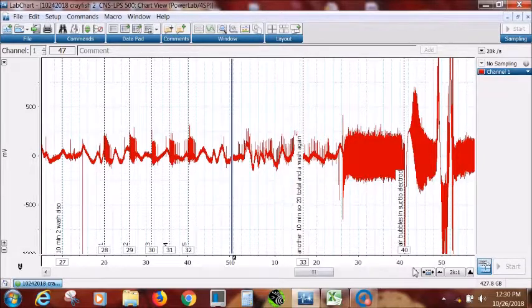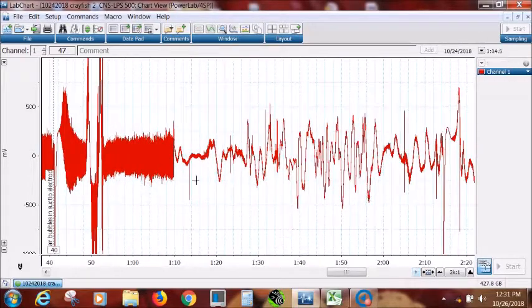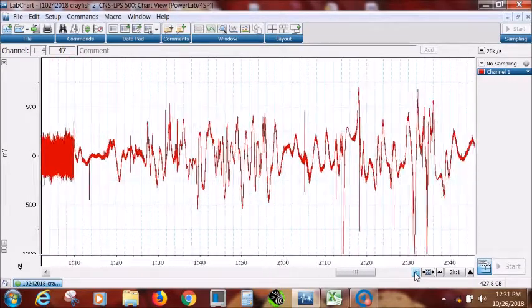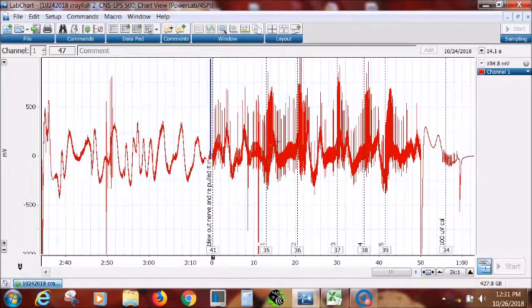And then we let it sit again, but here it says another 10 minutes, so a total, and it's washed again, so the saline's actually changed out again. Here it's changed out, and we got rid of the little air bubble that was inside the electrode. This is all that noise, and now we see here are the last 5 runs. 1, 2, 3, 4, 5.